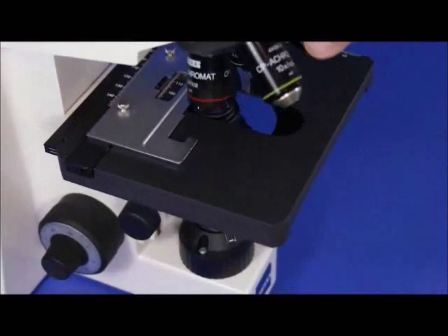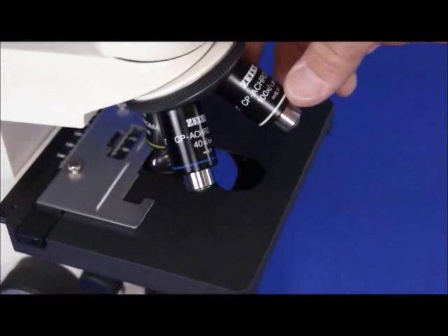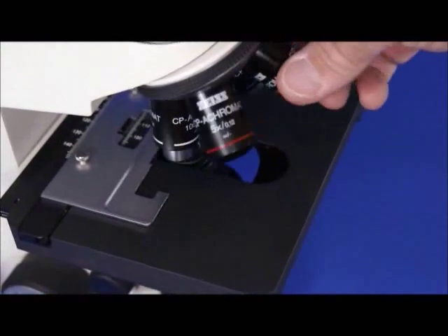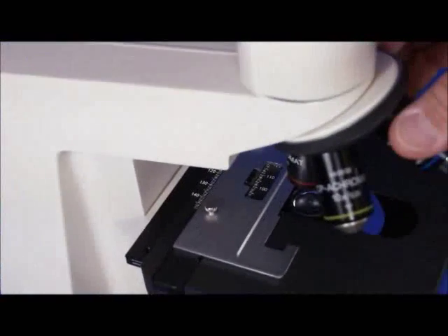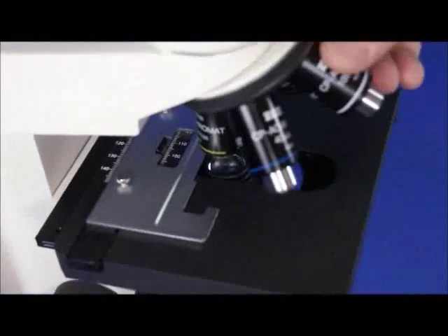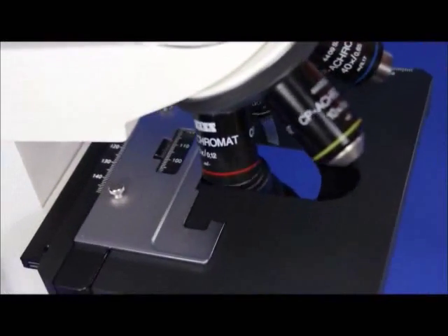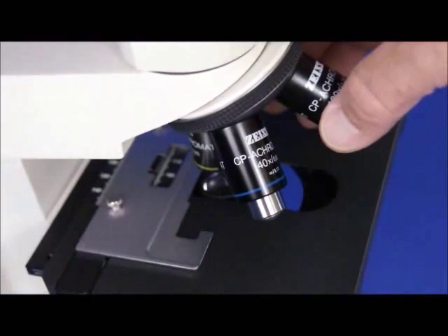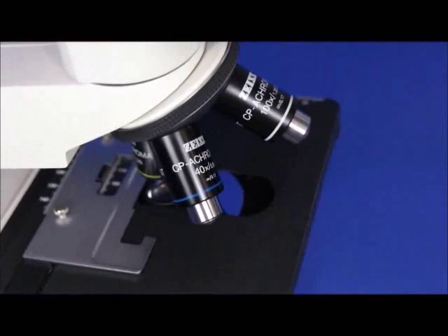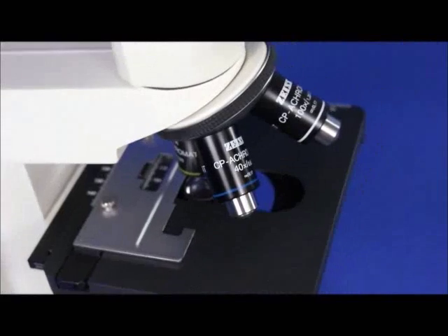Another nice thing about this scope are the plan achromatic lenses. These are highly corrected, flat-field Zeiss CP achromats — they're truly plan achromats because they are totally flat. You have four objective lenses: a 5x, a 10x, a 40x, and a 100x. They're all flat field, highly corrected, high resolution, high numerical apertures, and they are infinity corrected as well.